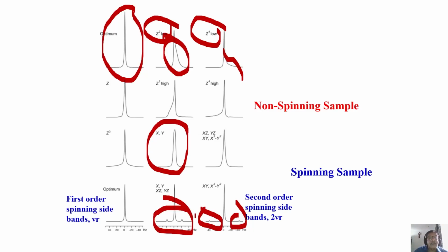So varieties of these shim coils will be there. And mind you, getting the homogeneity is not an easy job. You have to iterate upon all of these things. Every time you change these things, you are changing the currents in the shim coils. As a consequence, you are creating the counteracting gradient fields to cancel out the imperfections or inhomogeneities which are inherently present. These are things which you have to practice, and it is not an easy job. And finally, when you are expert, when you do all those manipulations, you will get an extremely good homogeneous field, and lines will be very, very sharp.